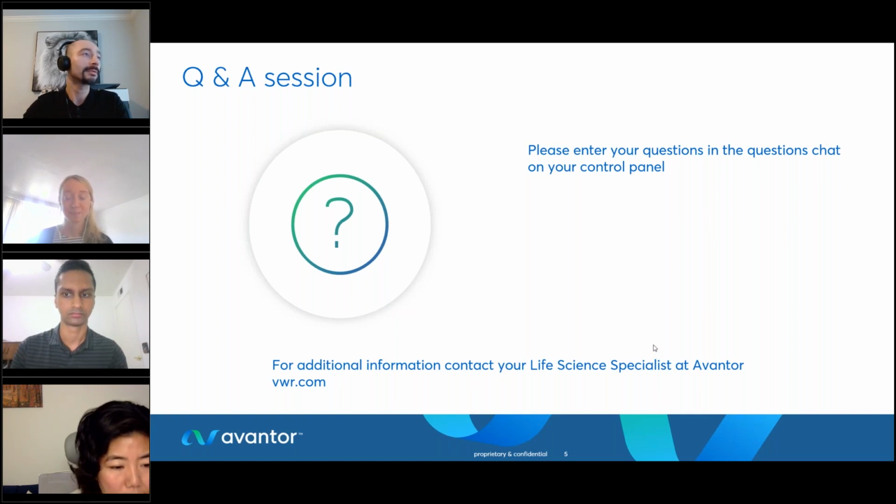So there is a part of the workflow which looks for variants. For that, it's just the same coverage that you require for the rest of the workflow, and you'd have to input a reference insert, and that would give you some information on any variants that are found in the downsampled data. But in general, we don't search for contaminants in the data. The workflow doesn't, at the moment, cover that use case.